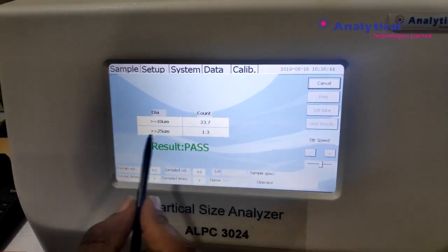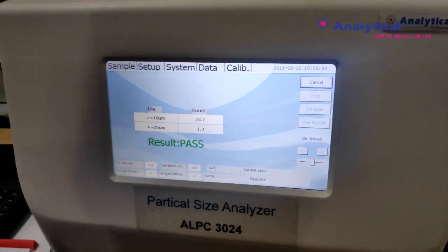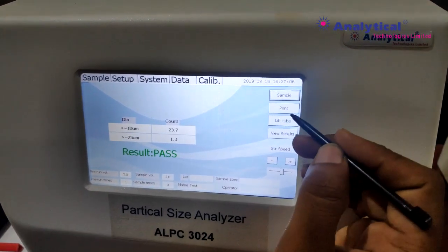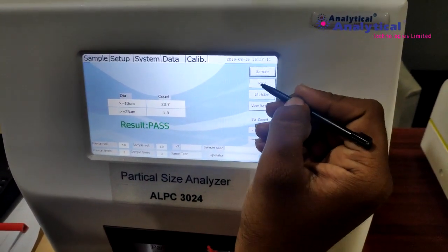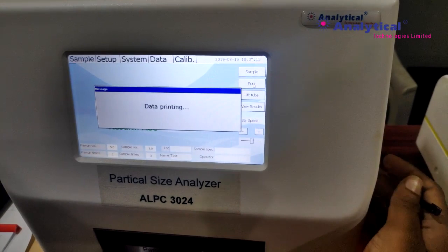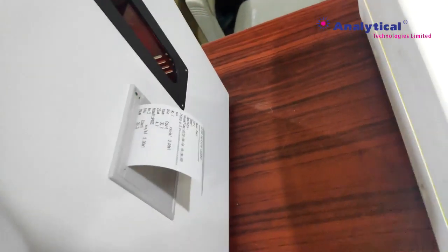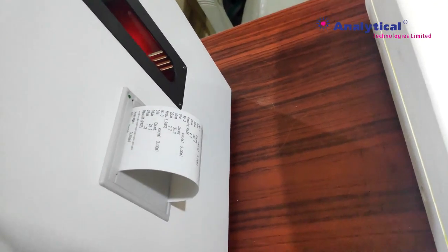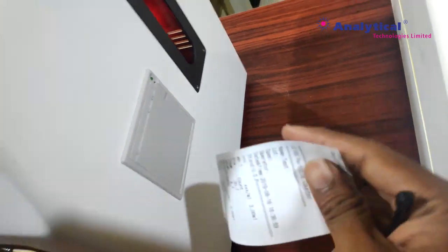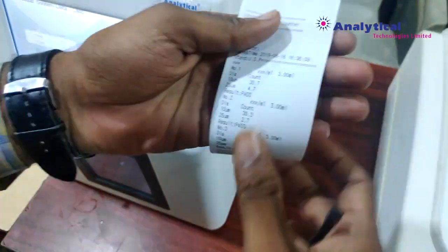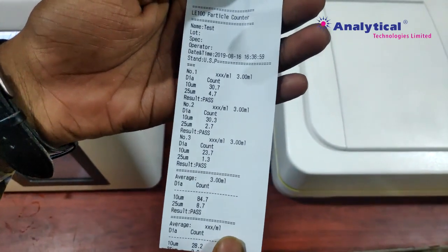You can see directly the results of these three samples. Now we can print it directly with the particular three samples data. You can print it directly with the average ratio of this particular sample.